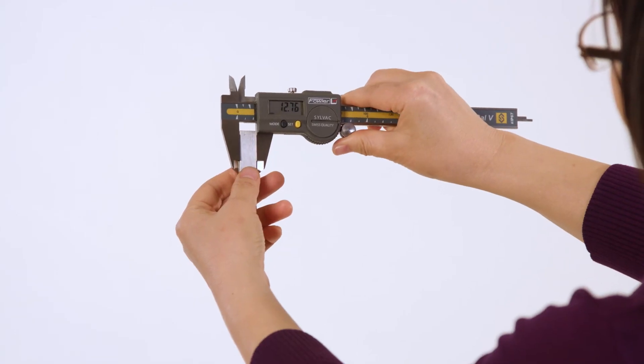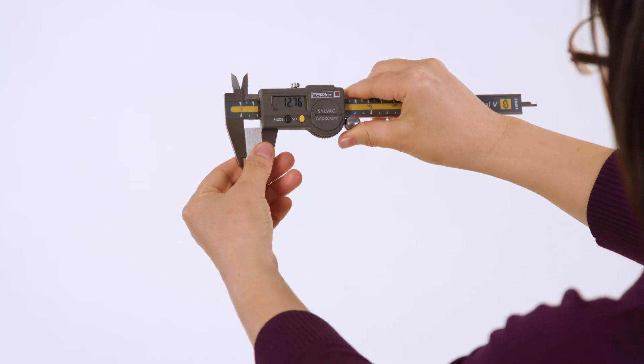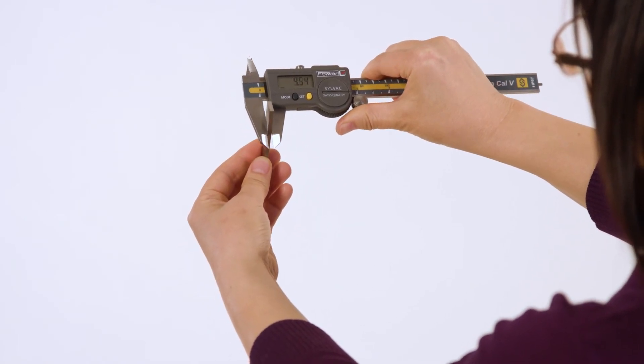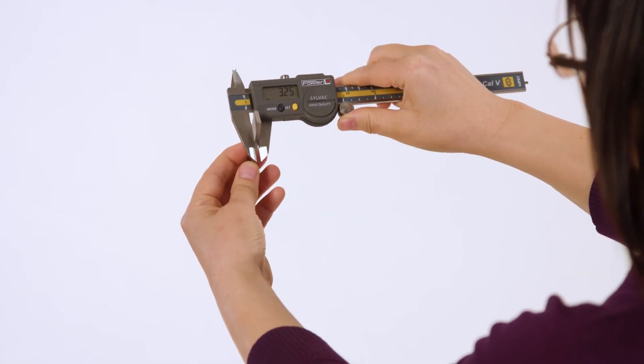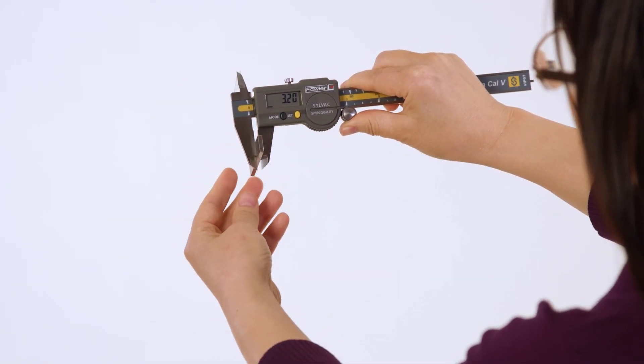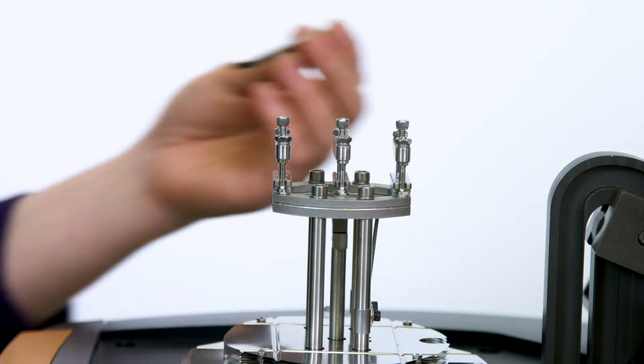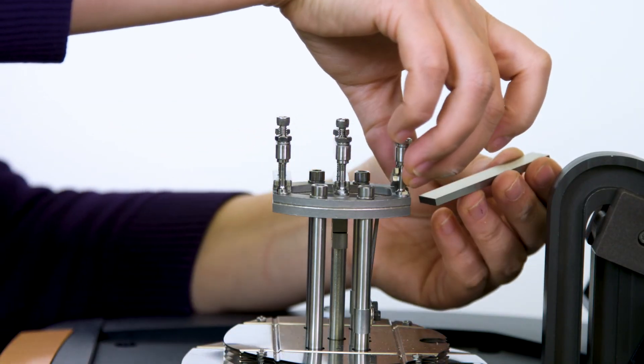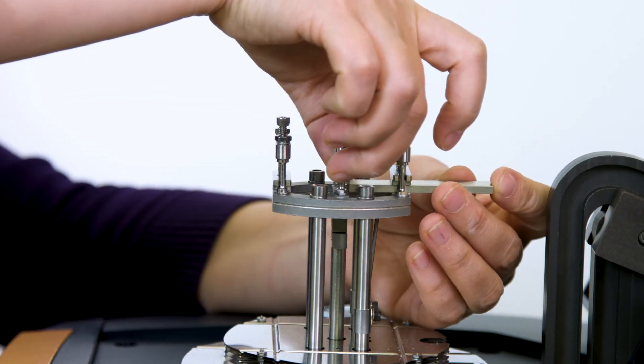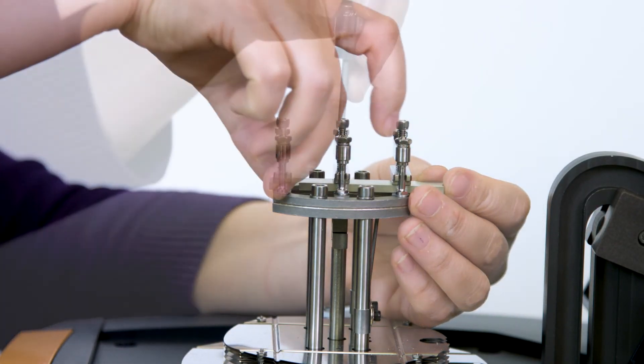Using a caliper, measure the width and thickness of this precision steel compliance sample. Then mount the steel sample to the clamp using 8 to 10 inch pound torque.